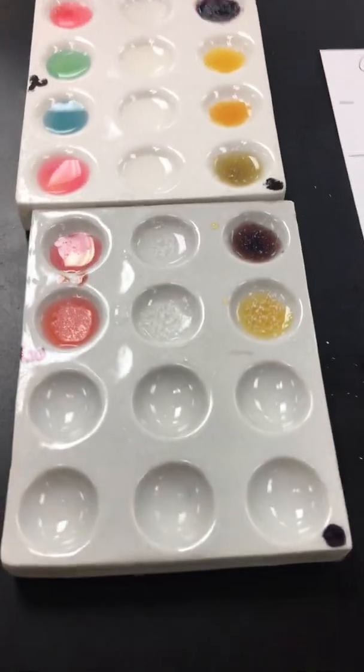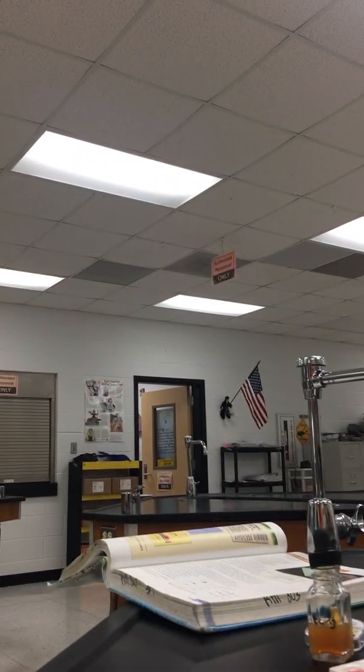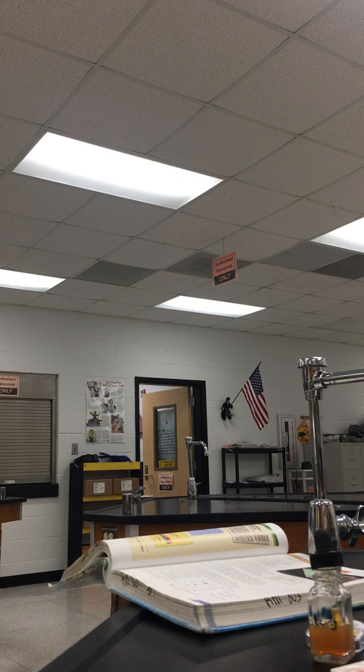So now what I'm going to do is put some unknowns in the bottom. We're going to do unknown 1.